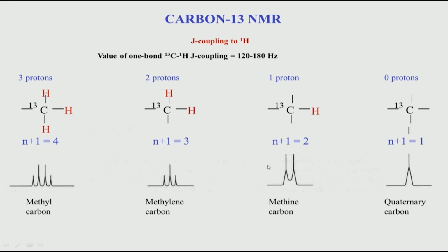So, by looking at the coupling multiplet, in principle, yes, it is very useful information, you can get the multiplicity. But if you see, the number of peaks has increased, it has 4 peaks instead of 1, and remember the couplings are large here. So, when a coupling is large, the separation between the multiplet lines is also large. That means it occupies a large range of chemical shift, unlike protons.